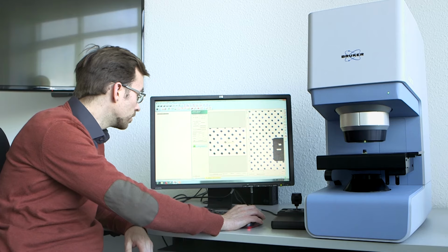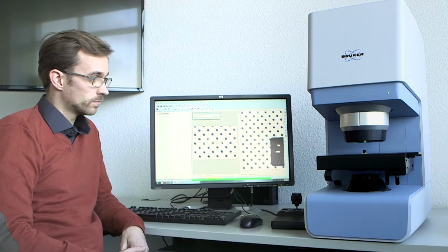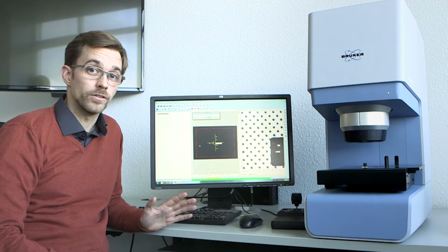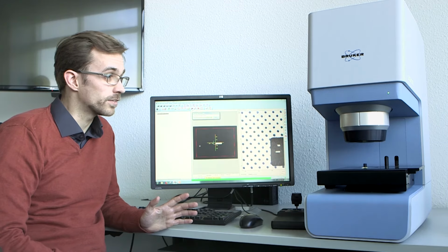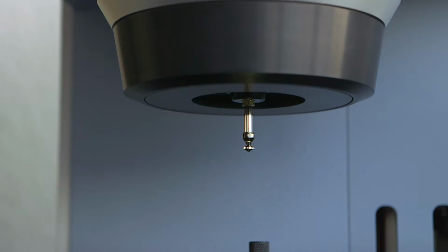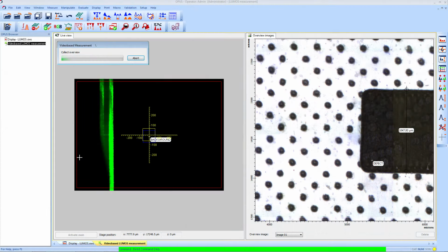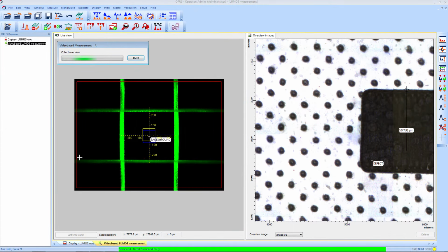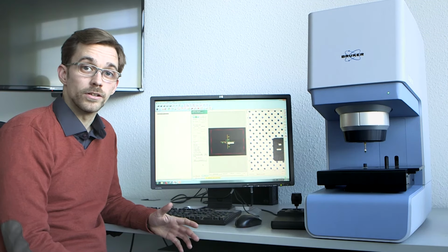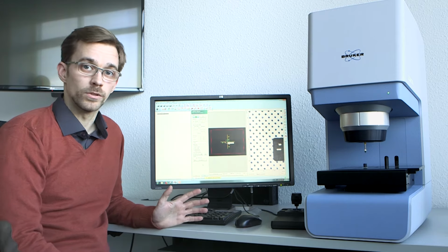So what we do now is measure the background. The LUMOS moves the sample stage out of the way to make room for the fully automated ATR crystal that is housed within the objective. On screen, you see the laser illuminated knife edge aperture, which is set automatically without the need for manual interaction. Now that our background is measured, all that's left to do is decide where we want to measure.